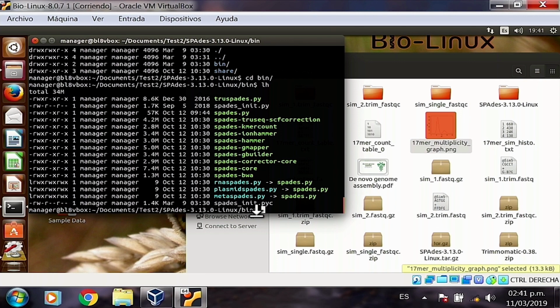Remember, the bigger the k-mer, the more RAM you're going to use, and the more k-mer sizes you give it, the more time consuming it is, because you have to repeat the assembly from scratch. But the nice thing is that it builds a multi-k de Bruijn graph, with different k-mer sizes, and therefore it will produce a more correct assembly.